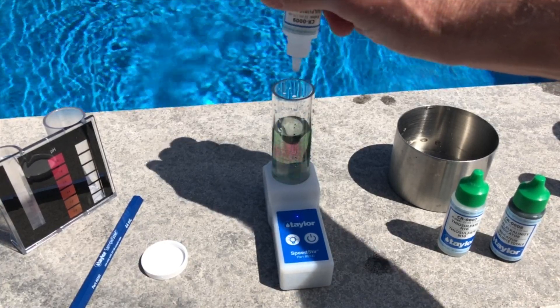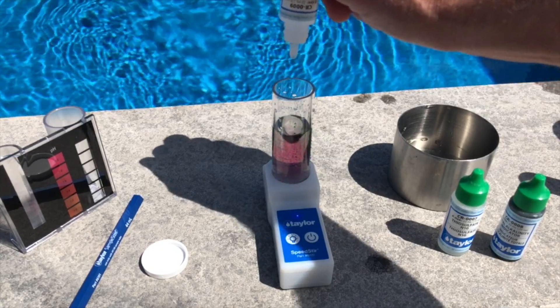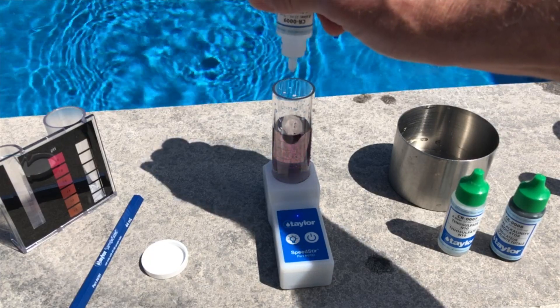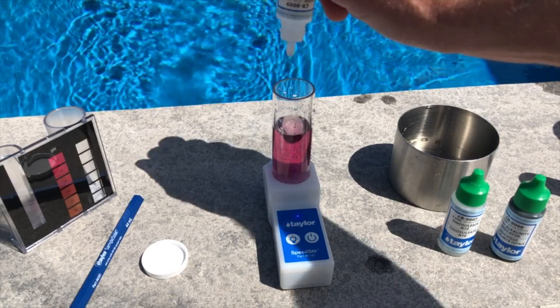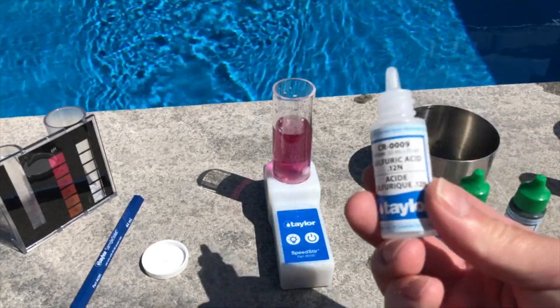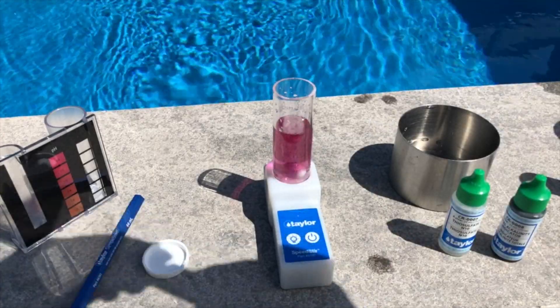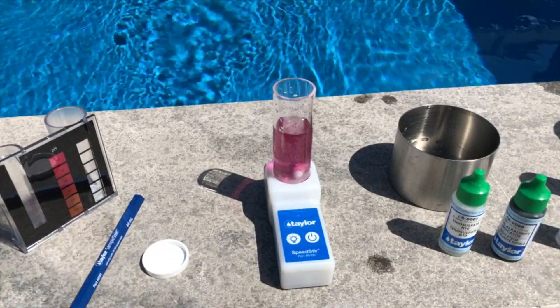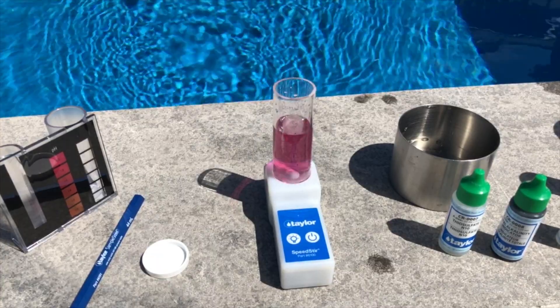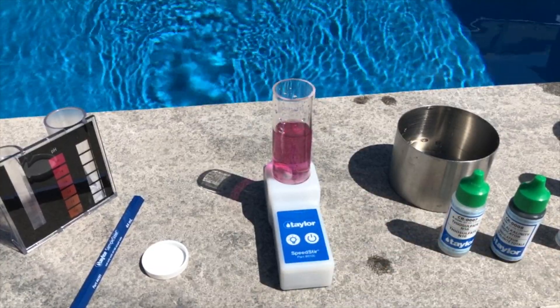On our final drop it'll stay a solid red, and that's when you know you've reached your endpoint of the titration. There we go — we got a full red sample, and that was 12 drops. So we multiply 12 drops times 10, and that gives us a total alkalinity of 120. We're looking for the sample to turn from a bright green to a bright red to indicate our total alkalinity.